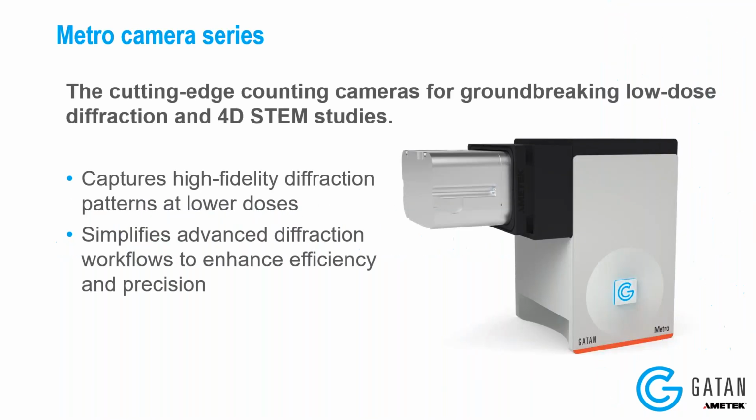The Metro camera series are cutting-edge counting cameras that can be used for really groundbreaking low-dose diffraction and 4D STEM studies. There are two cameras. The original Metro camera operates from 60 to about 200 kV, while the Metro 300 camera goes from 80 kV up to 300 kV. The sensors are optimized for different kV ranges, but otherwise the cameras are identical.